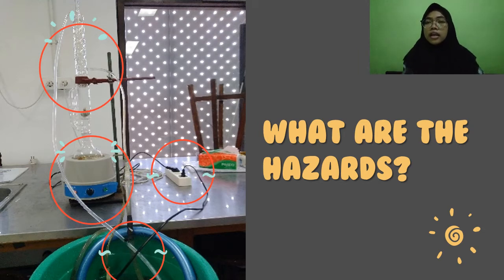And then in the round bottom flask, there is ethanol, which when heated will evaporate. If the set is not tightly closed, ethanol vapors can escape and spread into the room and cause dizziness.